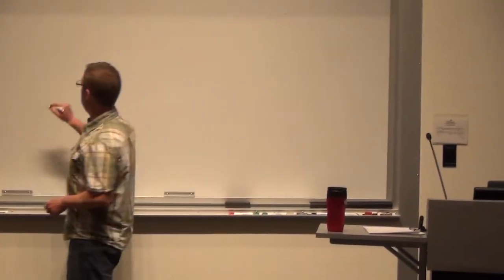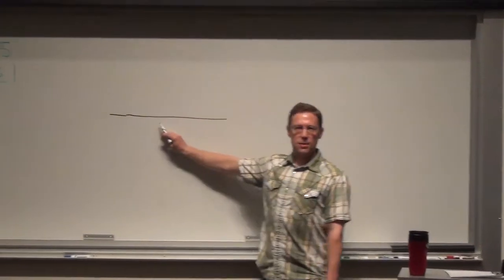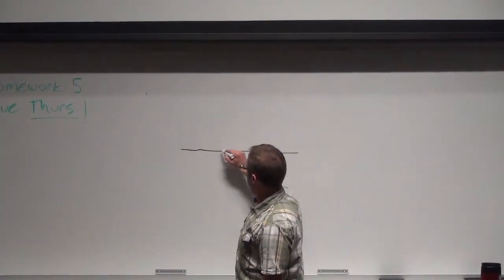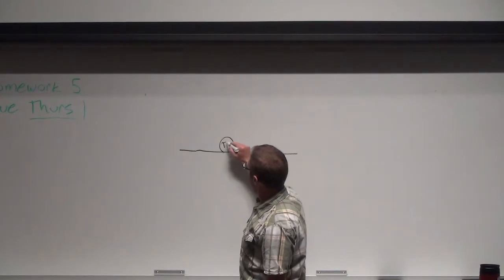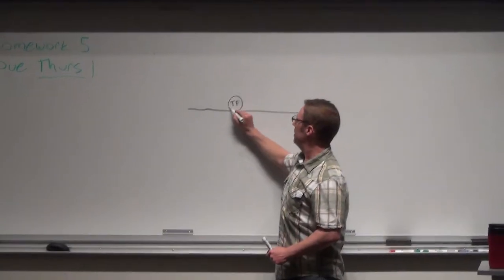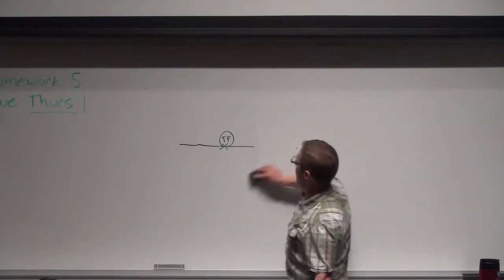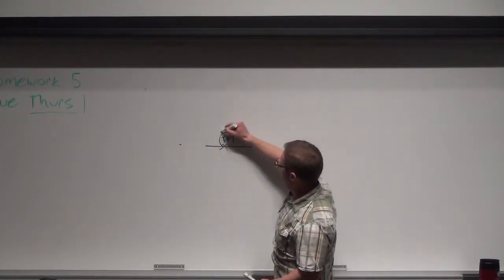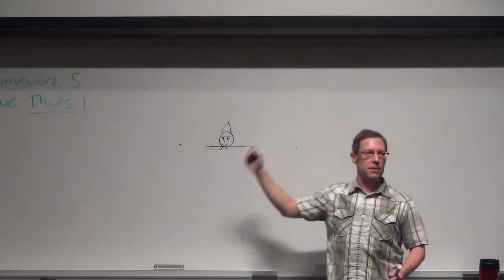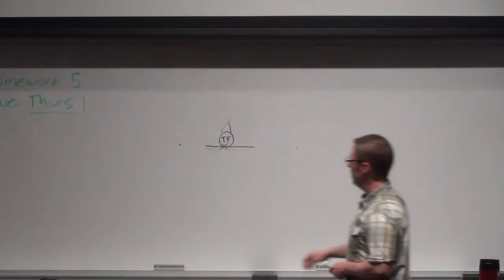Normally the way you detect transcription factor binding sites is you have your stretch of DNA, right? You've all heard of ChIP-seq. A transcription factor binds to DNA. Normally in ChIP-seq you use formaldehyde to cross-link your DNA to the protein. You then shear up the DNA, use an antibody to pull down that transcription factor, reverse the cross-links, and sequence the DNA. That's the standard method for identifying transcription factor binding sites on a genomic scale.